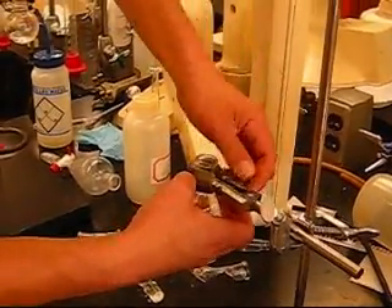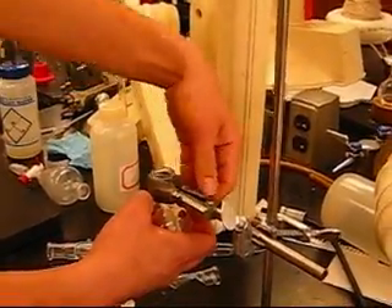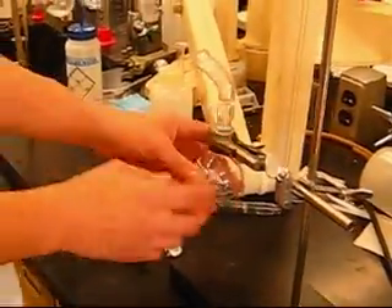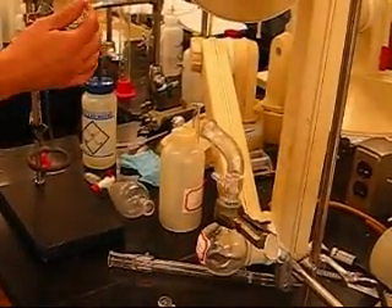Today's date is April 15, 2009. This is Wednesday morning, Organic Chemistry 1, Instructor Mr. Duff. So once you set that, you're going to set this piece right here, and we saw these two pieces go in.